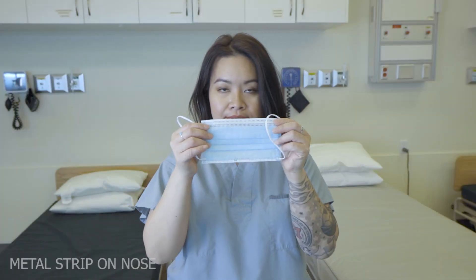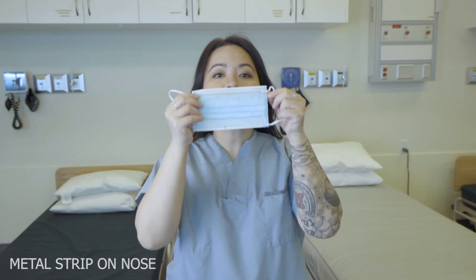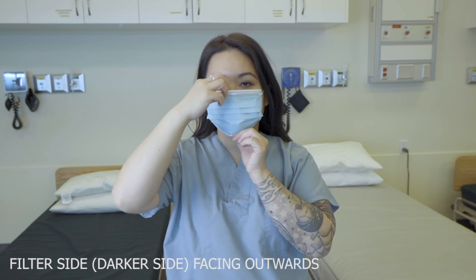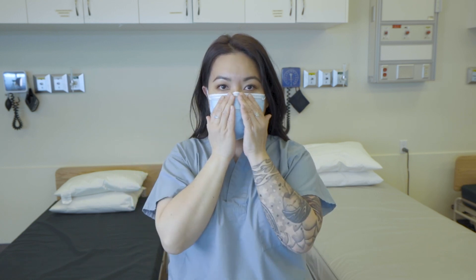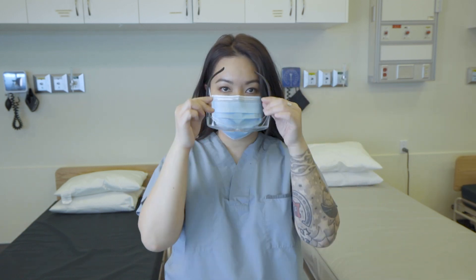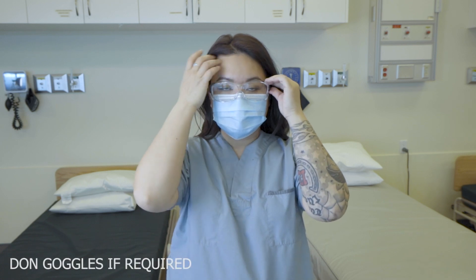First, with a standard face mask, we want the metal strip to be on top of our nose and the darker colored portion of the mask to be facing outwards because it contains the filter. We want the metal strip to be snug around our nose and the rest of the mask to be pulled underneath the chin.